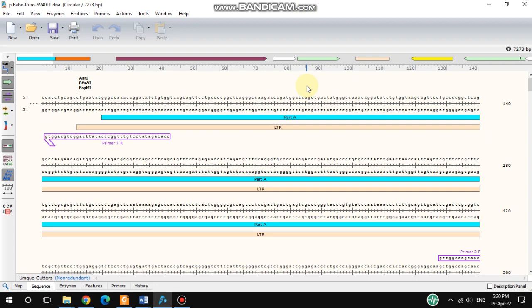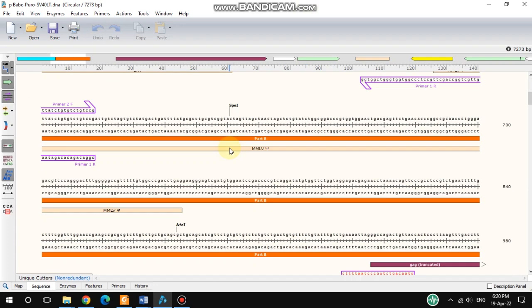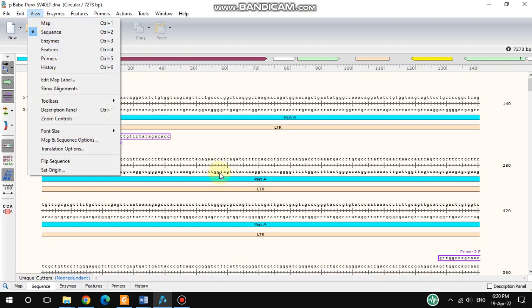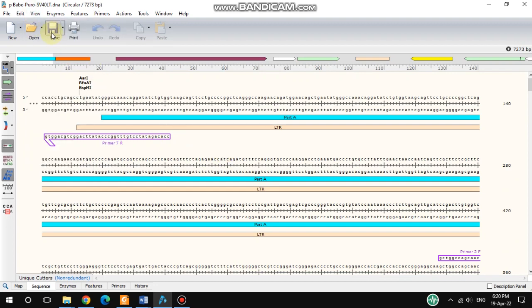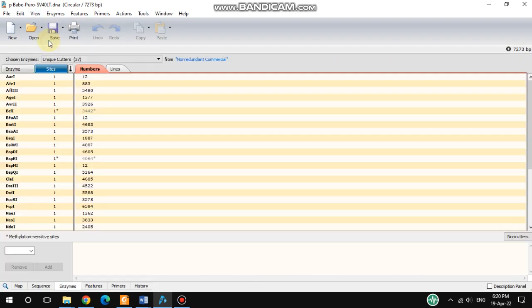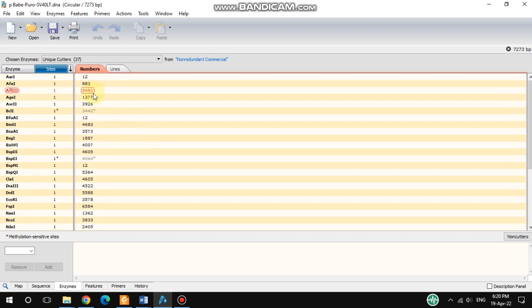In SnapGene, you can find restriction enzyme sites by clicking the View option. Under that option you will get the Enzymes section, where you will see all of the enzymes available, including their sites.